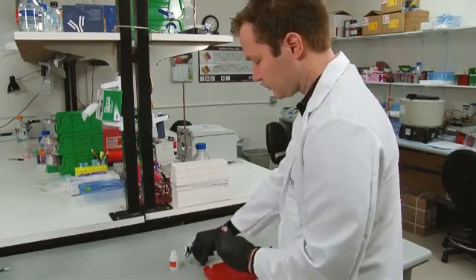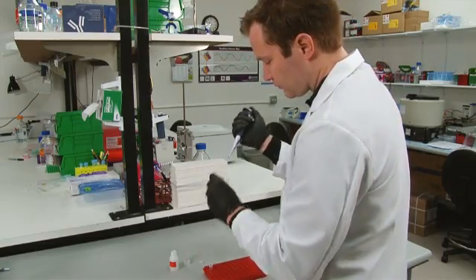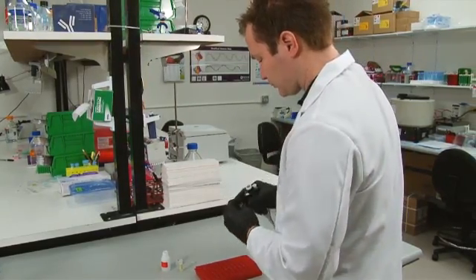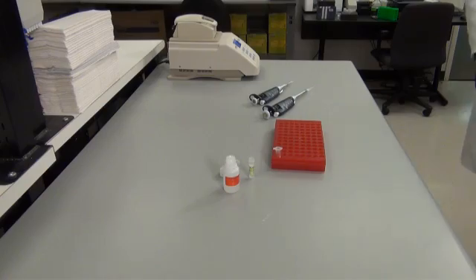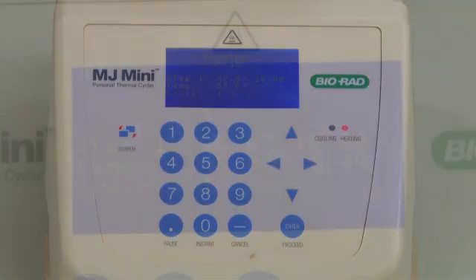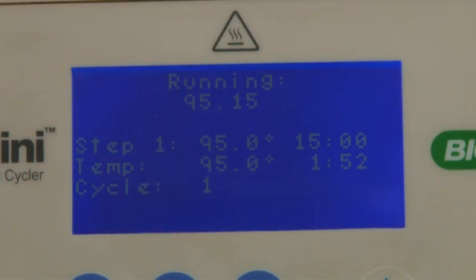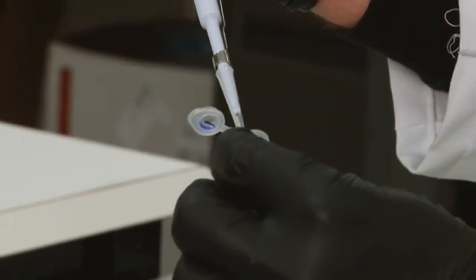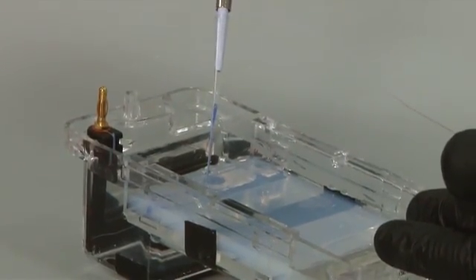To do this, dilute the 40 microliter sample with 160 microliters of IP elution buffer and 8 microliters of 5 molar sodium chloride. All buffers are detailed in the written protocols found in the support section of the Novus website. Incubate at 95 degrees Celsius for 15 minutes. Finally, run 10 microliters of the diluted sample with loading buffer and DNA binding dye alongside a 100 base pair ladder to verify fragment size.